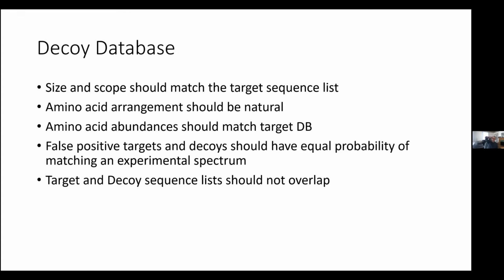Okay, so continuing that thought, we really need to preserve the amino acid abundances for the target and decoy database. You can't move those around.